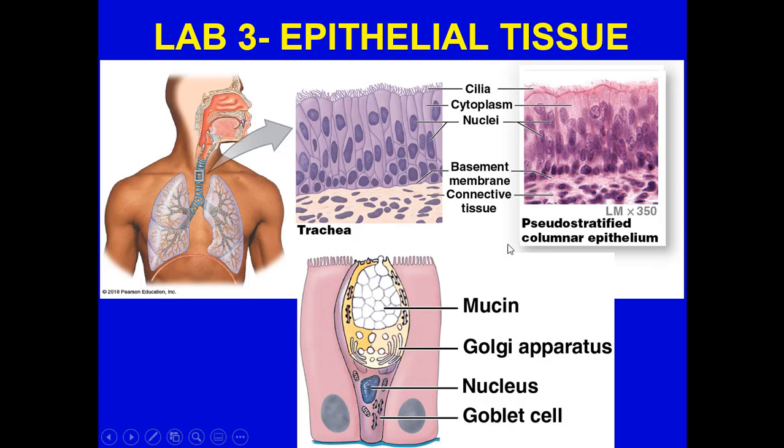Okay? Now, the other thing you're going to find very common in trachea tissue, right next to the pseudostratified, is single cells, such as you see here, and these are called goblet cells. A goblet cell basically has an attachment down to the basement membrane, but it's involved with making a lot of mucin, which when mixed with water becomes mucus.